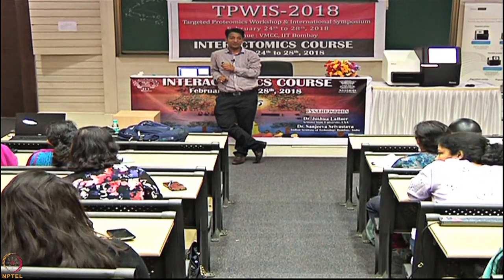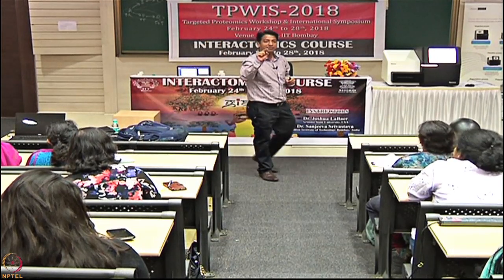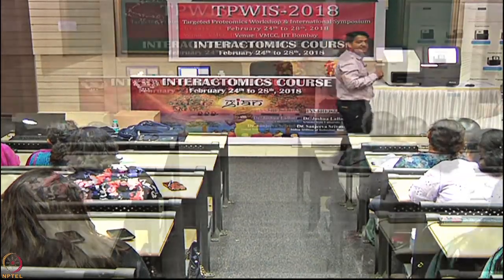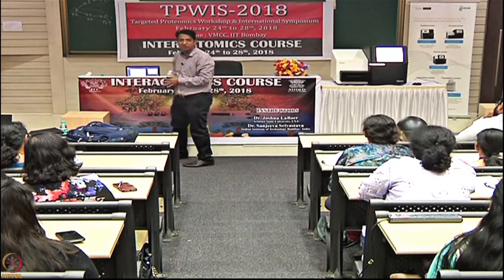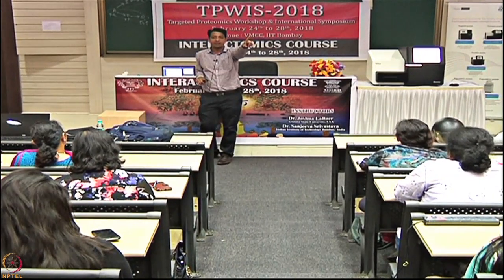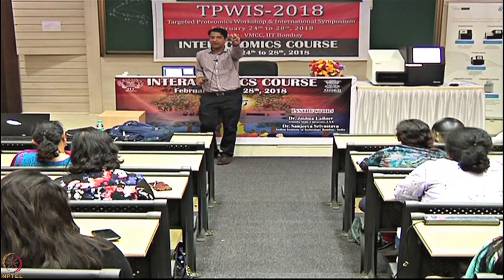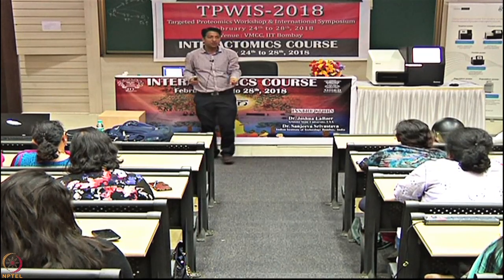3 million. So 3 million Sanger reactions you need to carry out to complete the human genome sequence, and the sequence you will be getting will be covered at 1x coverage. So even if you carry out 3 million reactions, you will be covering your bases how many times? 1 time. So the coverage will be 1x. So if you wish to sequence a human genome, do you wish to invest 10 years more?